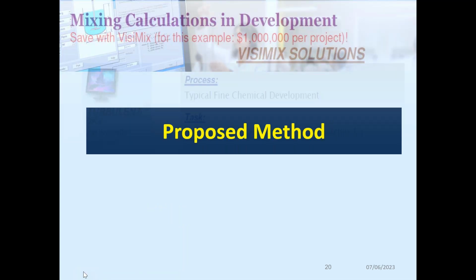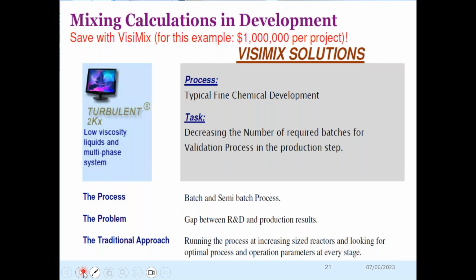Based on it, the best idea that we sometimes explain to you is that we need to find a way, during the growing of the process, to understand that we have other phenomena, flow and mixing, that are part of the phenomena that happen in the tank.